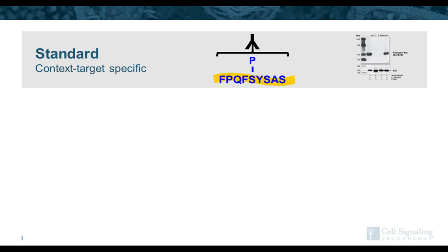And really the key to success in PTM Scan are the antibodies that we're using for that enrichment. So typically when we develop an antibody, we use a single peptide or part of a protein or even a full protein. Here we're showing a phosphopeptide. We raise antibodies against that peptide and then purify and end up with something that's really nice and specific for one given protein site.